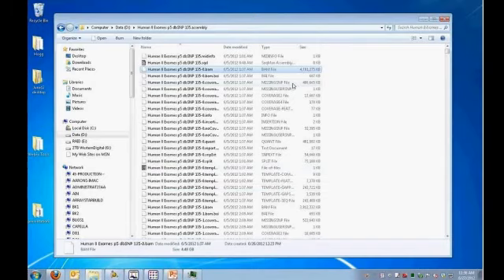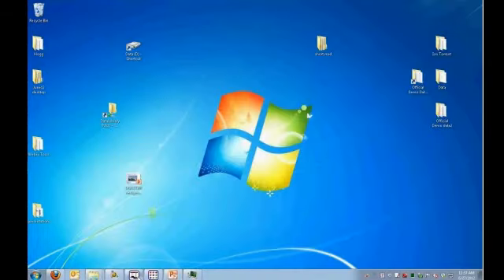We build all these accessory files so that when you do your BAM file analysis in SeqMan, it's going to perform vastly better than a BAM file in a viewer program. And so we build this set of accessory files, package them up. It makes the BAM file that much better.